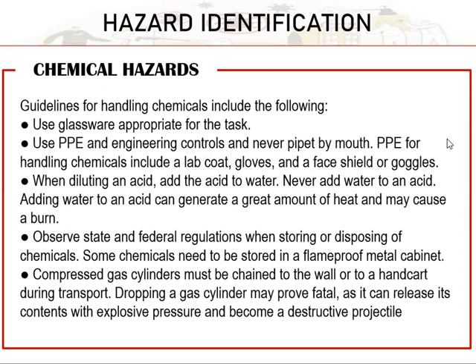Okay, so just remember acid, letter A. So siya imuhang ibutang si acid. So never add water to acid, because it can generate a great amount of heat and may cause a burn. That is the reason why dili gyud pwede ang the other way around.